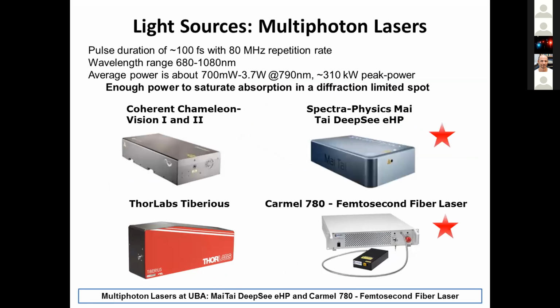Moreover, we can also have multiphoton excitation, and in the market there are different options. The good thing about multiphoton excitation is that we move our excitation to the near infrared, and this is very useful, as I will explain in the next slide. And they are really powerful.